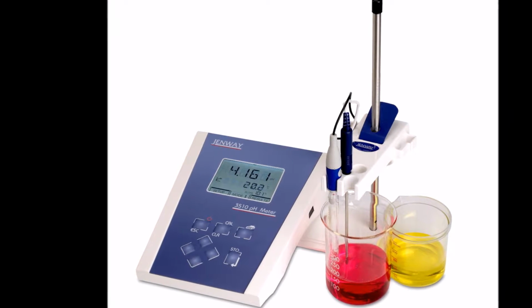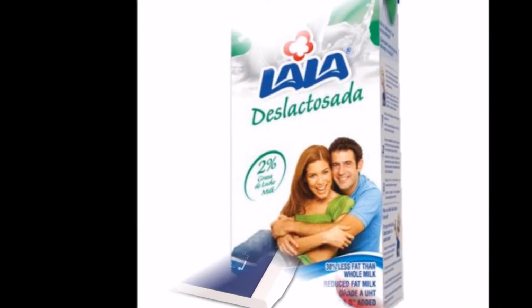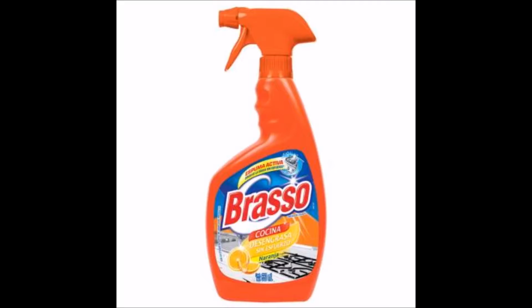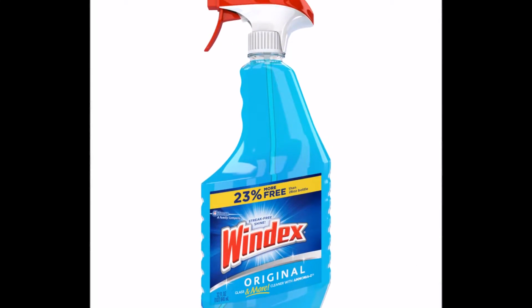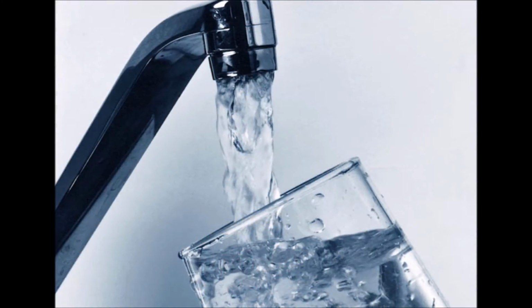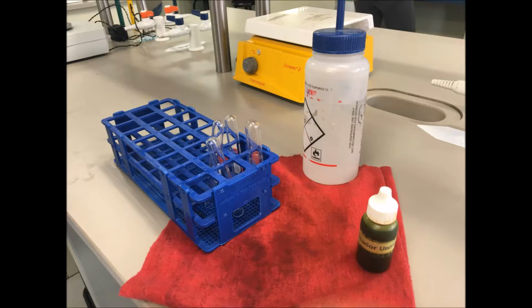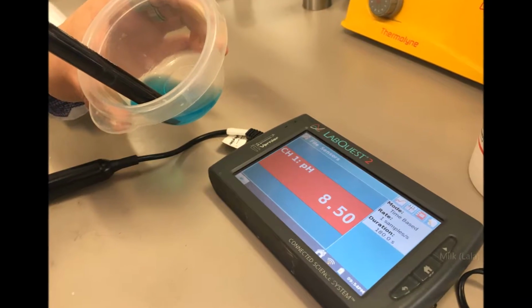Now, the substances that we will need are milk, dish soap, detergent, Windex, tap water, distilled water, and soapy water. We will also need 4 test tubes, the pH universal indicator, and the pH meter.